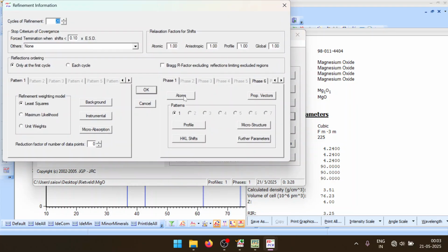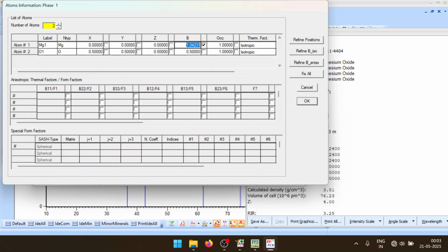The thing is that this is software and it does only mathematical optimization. So it is you who have to see that these parameters don't run out of range. If a funny number comes up here, just know that you have made a mistake and rectify it. Don't go on blindly taking B as 5 or -1 on all these things.